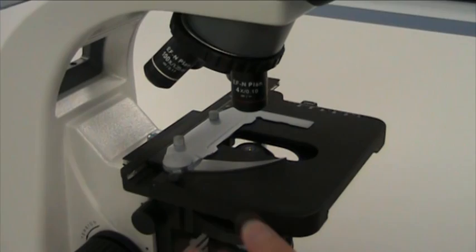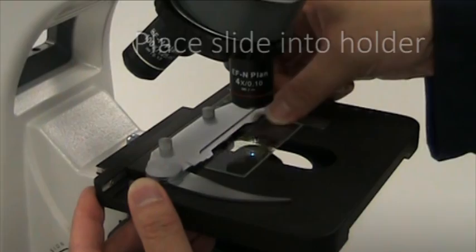Next, gently move the spring-loaded arm and place the slide onto the stage. Make sure the slide is held by the arms of the slide holder and not sitting underneath them.